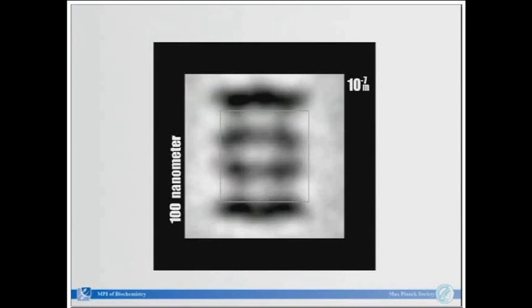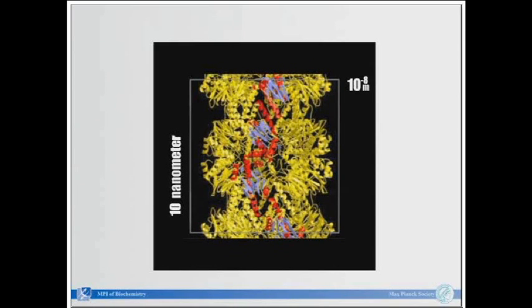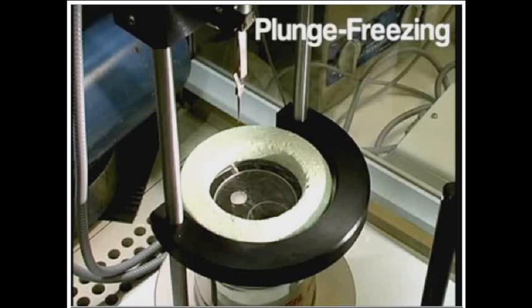Like, for example, this little guy here, this is the 20S. In the end, we would like to compare that structure, or fit it, with the X-ray structure. In this case, the 20S proteasome is very well known, but you would like to see it at work in the cell. So no purification, no isolation procedures, just the cell, then do tomography, and then do the whole task. That's the reason why we also use the cryo-electron microscope. Just to give you an idea how everything is done, because I guess this is the first talk where something hands-on is shown. So this is how we freeze in cells.